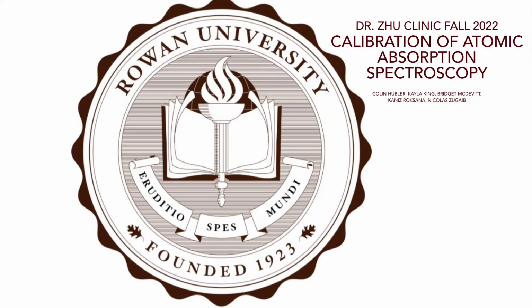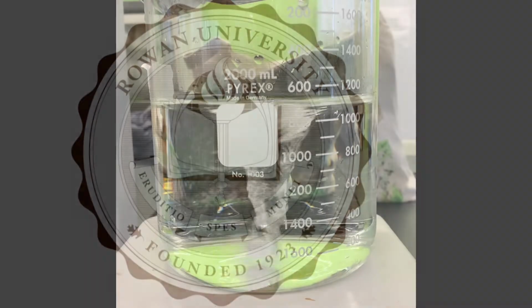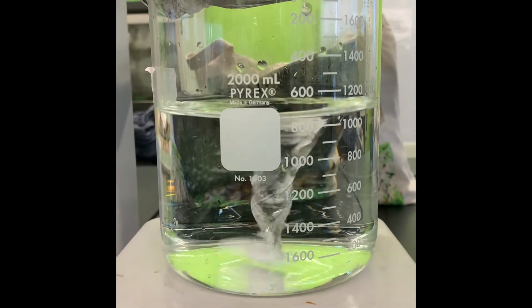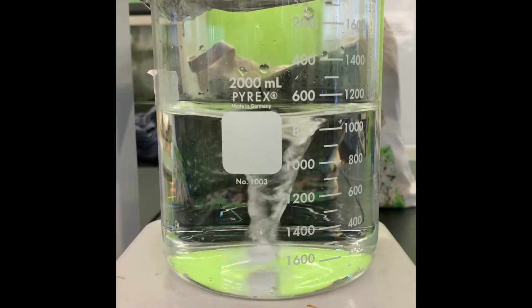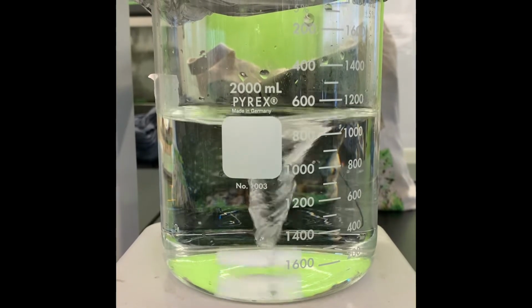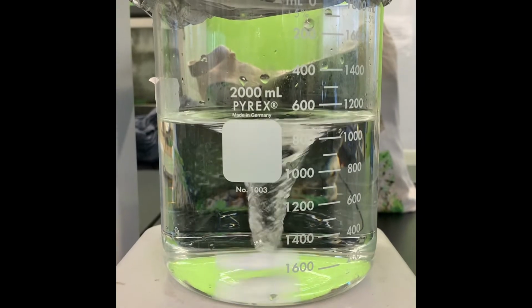The purpose of this video is to demonstrate how to perform a calibration of an atomic absorption spectroscopy device. To begin, we must mix a base solution. This base mixture consists of 1,000 milliliters of distilled water and 1.1098 grams of anhydrous calcium chloride. The solution we had mixed has a concentration of 10 millimolars.